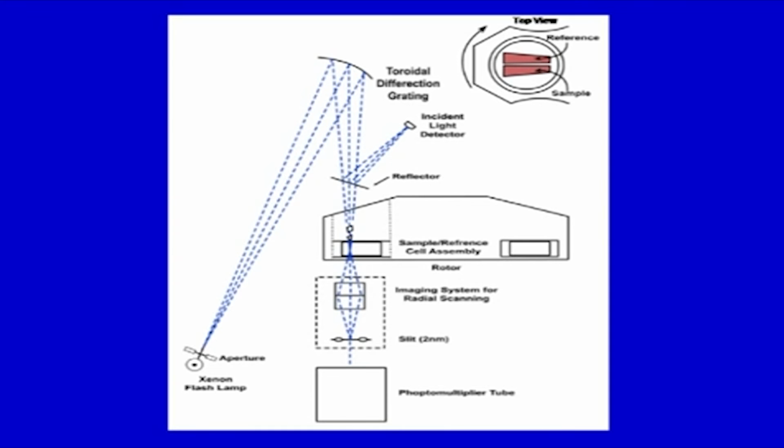of photographic film. If you see here, there is a reference cell, and they are sector shaped. If you can see, the diameter of this particular part increases as it goes from one side to another, so that there are no wall effects or sedimentation on walls actually, and they act like swinging bucket rotors only. So, this is how these are placed, and the analysis could be performed in here.